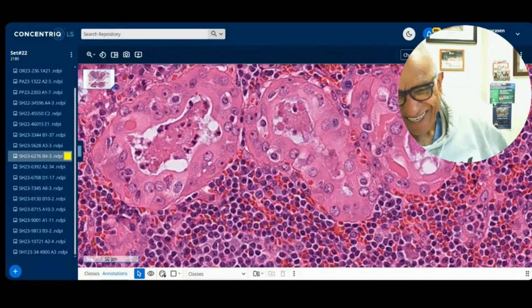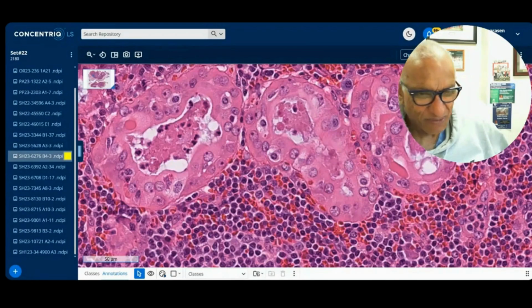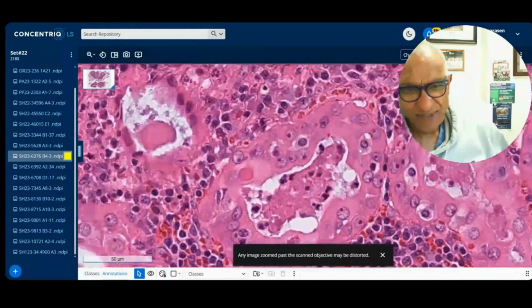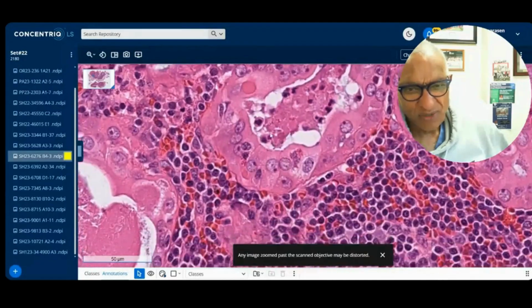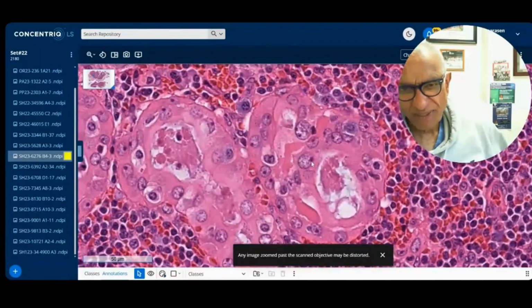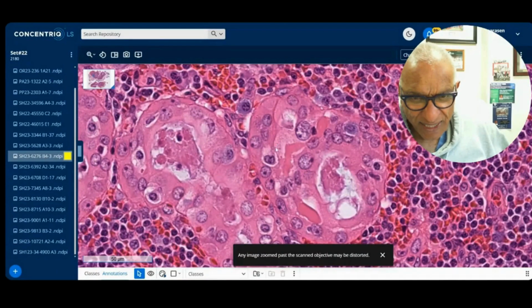Exactly. So these pale cells are mucin positive. I'm going to give it to you that this is mucoepidermoid. It is mucoepidermoid. Now, you don't get benign mucoepidermoid tumors, so you've got mucin there and you've got these squamous cells here. And many of these are oncocytic. Let's go back to our screen. It's actually difficult to even find squamous cells or the intermediate cells. Remember, you get three types of cells in mucoepidermoid carcinoma. Very hard. But these pale cells here are mucin positive.